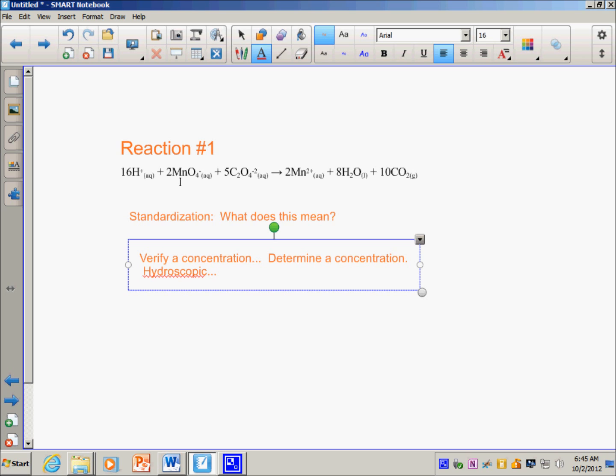So what we do is we titrate our compound we want to use against a standard. In this case, we're using oxalate. The actual chemical is sodium oxalate. Okay, sodium oxalate would then be dried, and it'd be a known dry standard that doesn't really absorb a lot of moisture. So we know that when we're titrating against this thing, we are truly getting an accurate value.